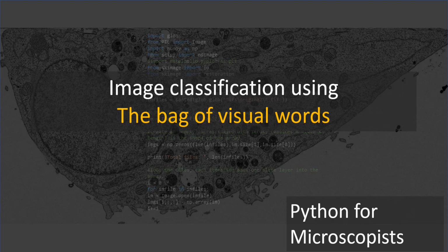So now we are trying to classify it. You have a whole bunch of cat images, dog images, and you're trying to say, okay, these are cats and these are dogs. So it doesn't matter at a pixel level what's happening when it comes to this application. It's basically, okay, what class does the image belong to? So a classic example for this in microscopy would be, is this a malarial infected cell or is this a healthy cell?